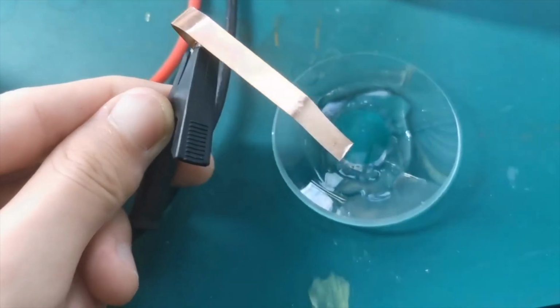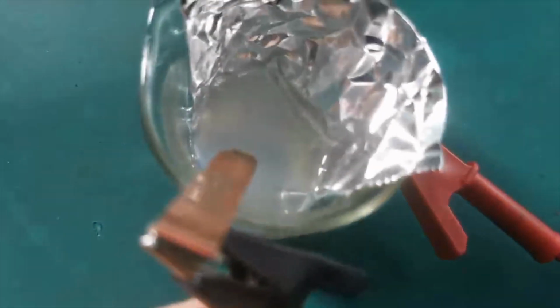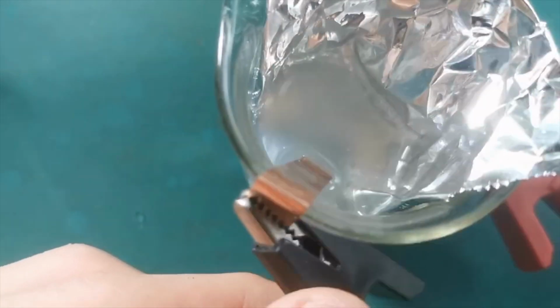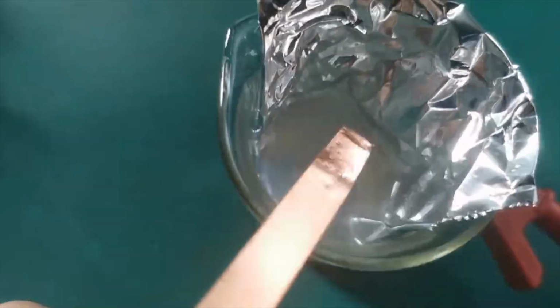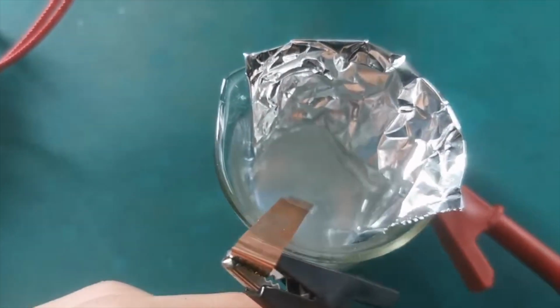The main problem with this production method is that the lithium chloride has very poor solubility in PC, in fact only a few grams per liter, and so the current running through is very small and the electrolysis speed very slow. There are two methods to increase the reaction rate. You can skip this 2-minute long explanation and directly jump to the takeaway version.